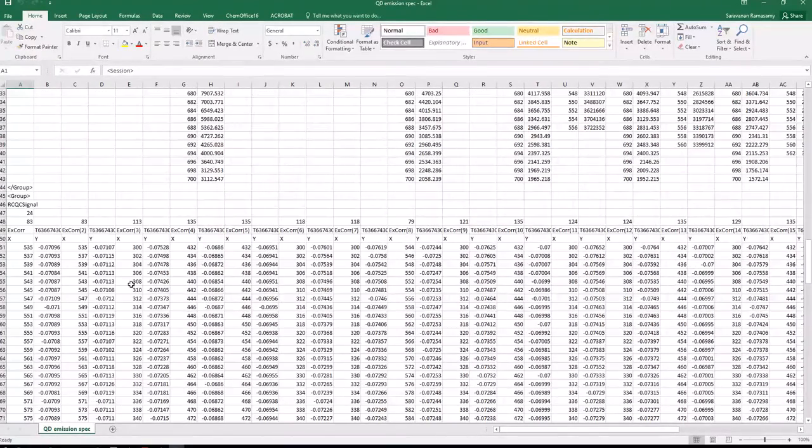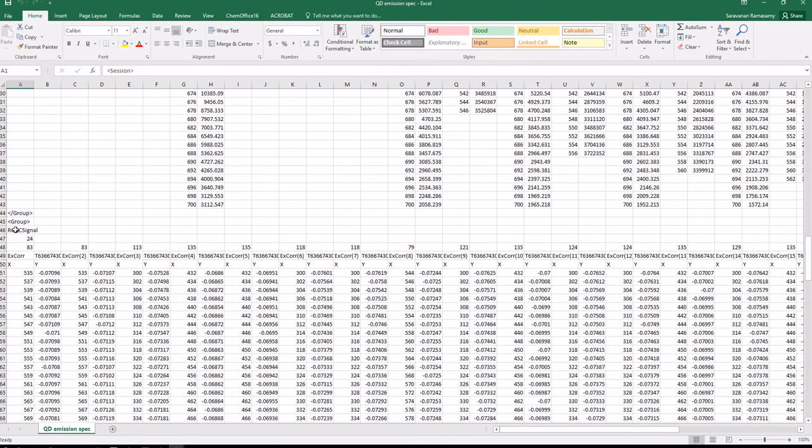You're right that we have a mirror image, or a repetition of the data, and this is something that I don't understand. Probably we need to explore what the data in the bottom means. It looks like it says excitation correction, but I don't know what was corrected, and the numbers are very low.